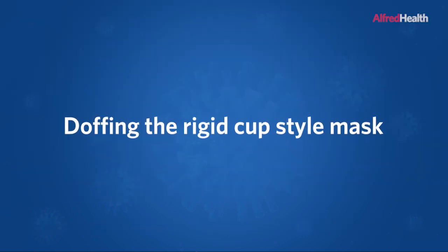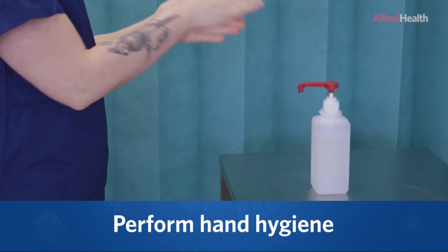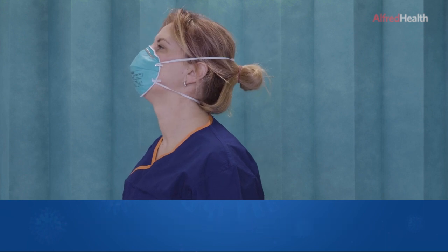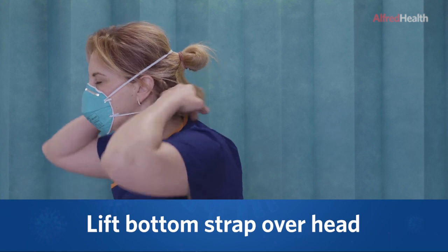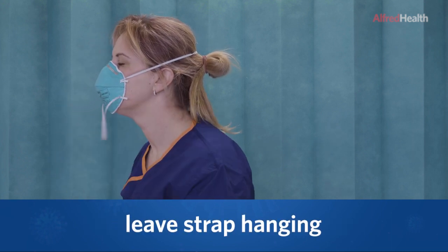Doffing the rigid cup style mask. Perform hand hygiene. Tilt your chin up into a sniffing position and bend forward slightly. Lift the bottom strap over your head in a slow controlled motion and leave the strap hanging under the chin.